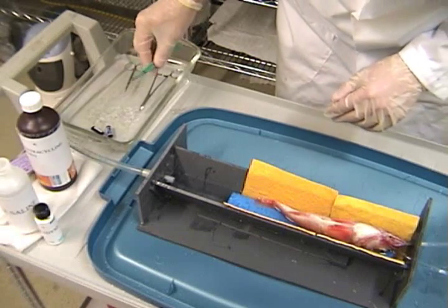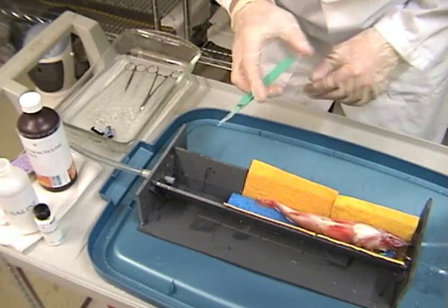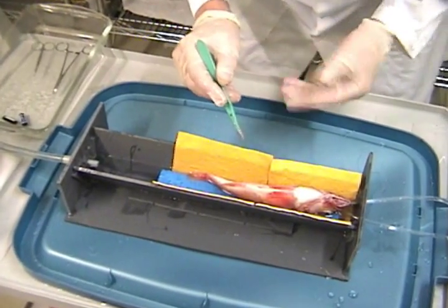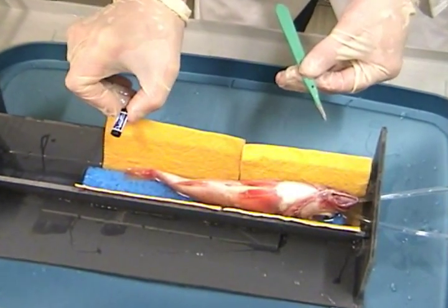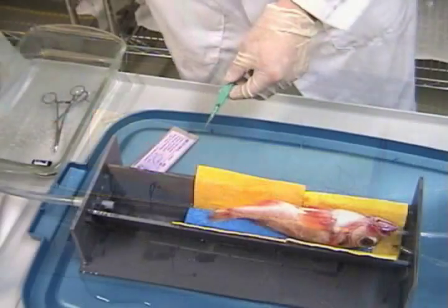For this surgery demonstration, I am using a dead rockfish purchased from a local market. Here we have our fish on the surgery table. When using live fish, you would use fresh seawater and anesthetic flowing across the gills of the fish. Today I am using a V9-2L Vemco acoustic transmitter which is 9mm diameter and 29mm length.